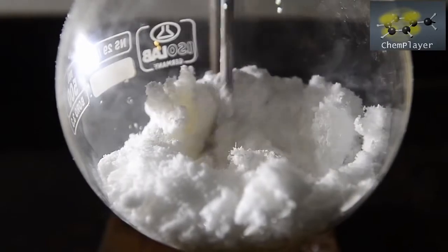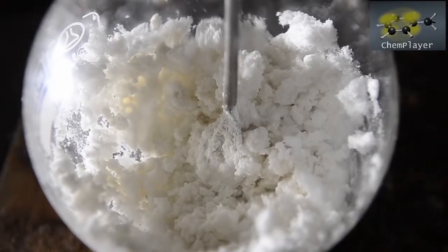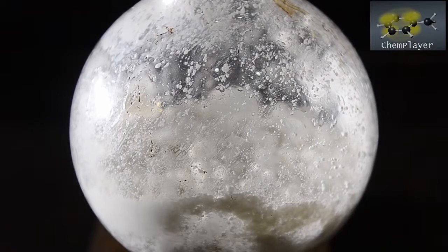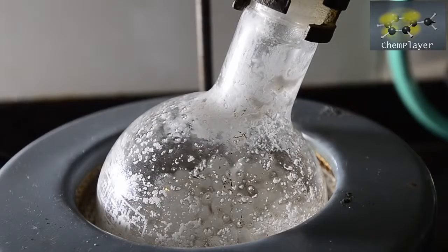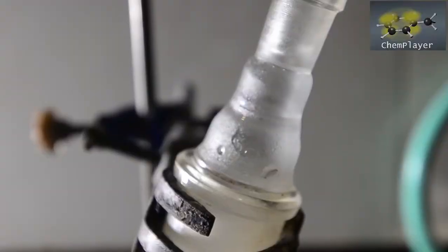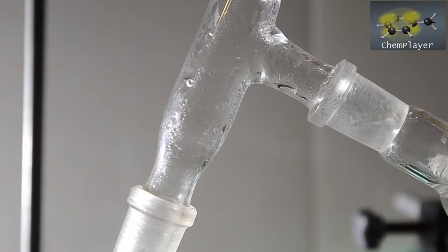The mixture becomes quite hot like before, but seems a little bit drier. There's a little bit of steam coming off. As before, we shook the flask to ensure a good mixing, and then set up for distillation. Medium heat to begin with in order to drive off the water. Soon we've got condensation, and then water starts to come off the mixture.